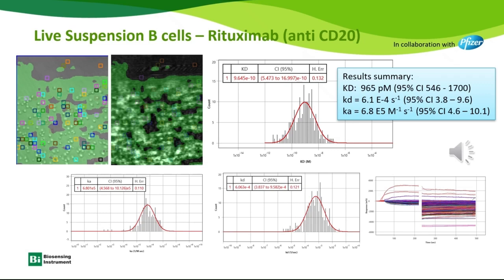So first of all, for the suspension cell, in the beginning we did have some difficulties because we don't really know how to fix them onto the surface or keep them on the surface, because they tend to flow in the buffer solution. Fortunately, with the protocol developed by John Brooks from Pfizer, we'll be able to grab them from the solution and keep them on the surface and study them.